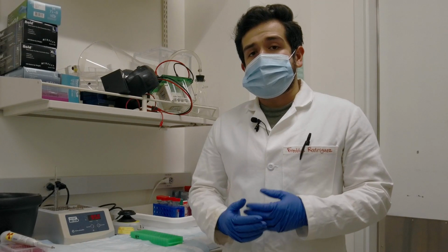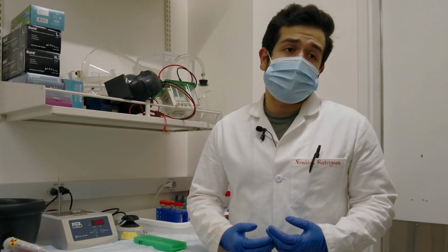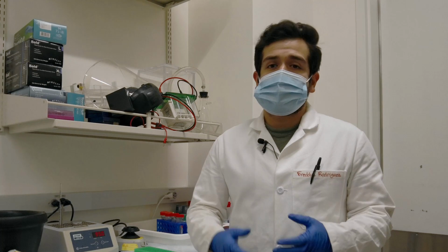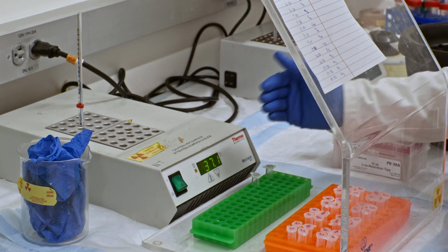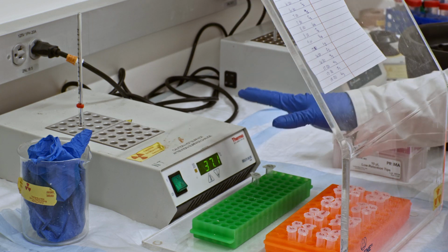Whenever you anneal template DNA onto primer DNA, you can leave it overnight, which is what I would recommend, or if you're really in a hurry and you gotta do this experiment, you can let them sit for about 2.5 to 3 hours. From there, you can use these primer template DNA duplexes on the same day to run your experiments.